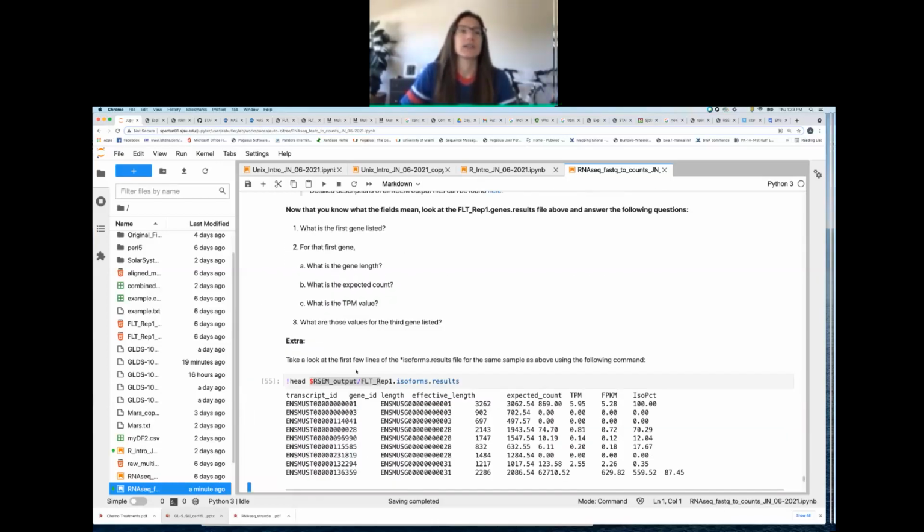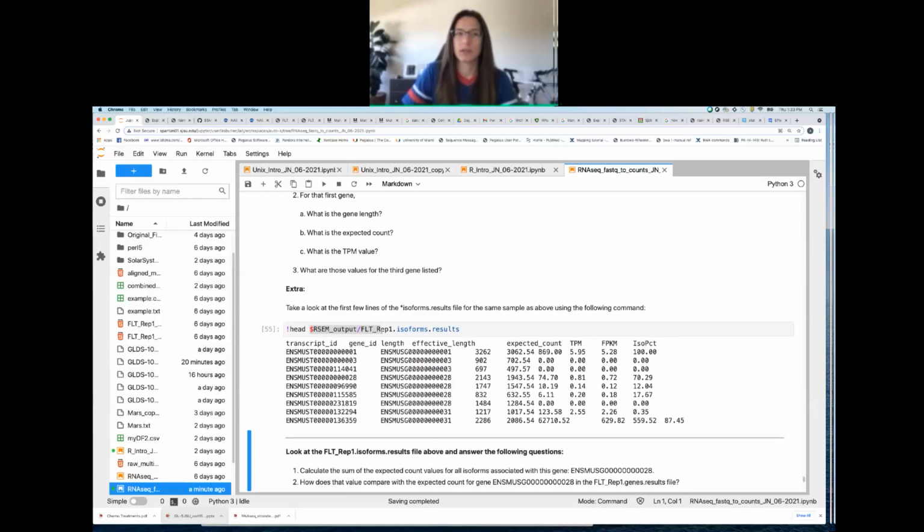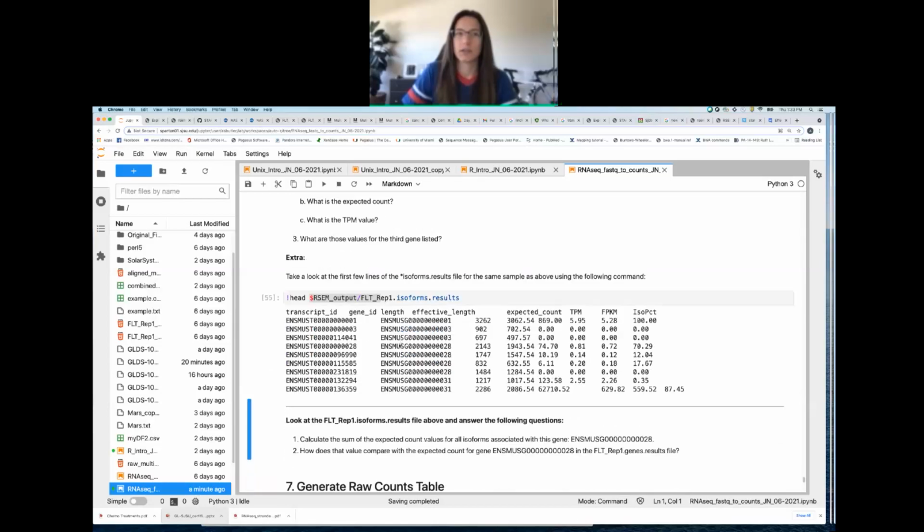Oh, actually, this ran because I kept mine running. Did everyone else's variables run okay, I assume? If you guys kept your Jupyter notebooks up, they should still be stored. So yeah, seems to be cool. So if for whatever reason you got an error here, a path error, you would just have to go up and rerun where we defined all the paths.